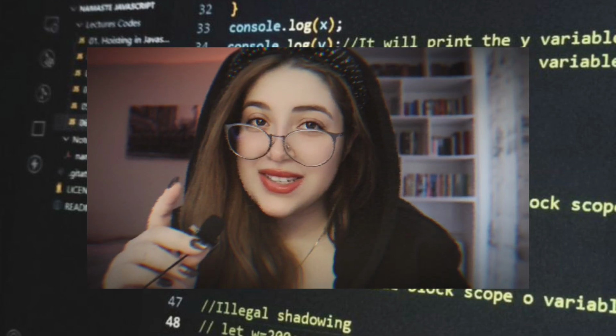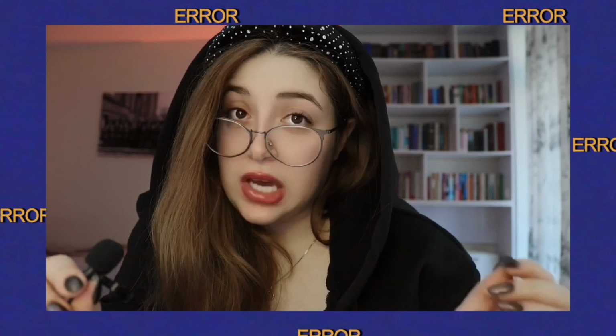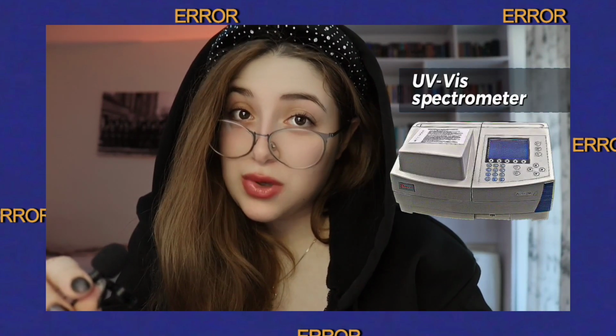Welcome to Sanaience. Ever thought of using Python to create artwork? Well, guess what? I just did that. But this isn't your ordinary data visualization. I took my experimental data, gathered with a UV visible spectrometer, and turned it into something completely unique.